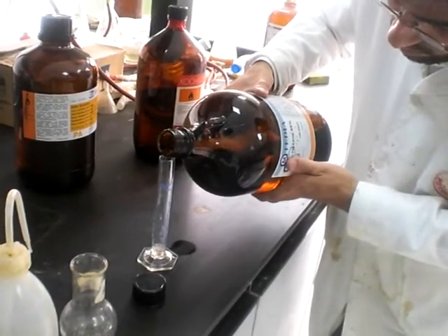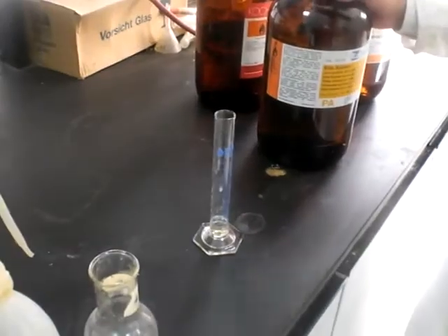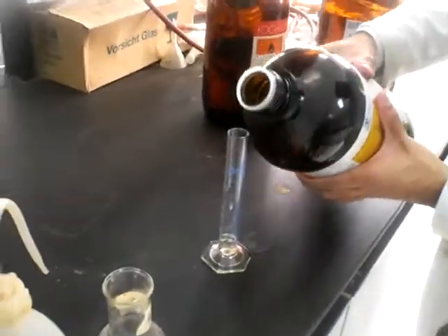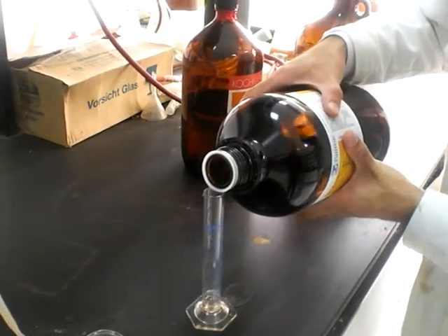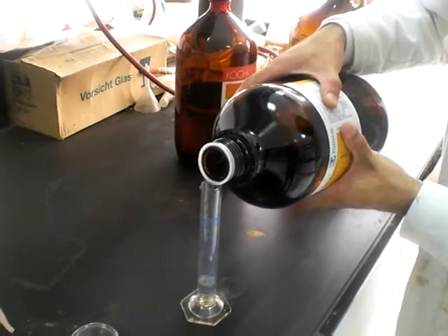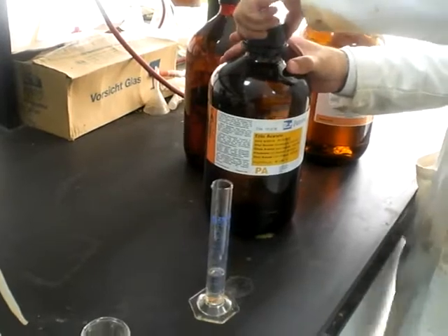The mobile phase is hexane and ethyl acetate. We add a certain volume of the hexane and another of ethyl acetate. This mobile phase is organic, non-polar, in order to suit the normal phase here, which is the silica. All the time, the stationary phase should be orthogonal to the mobile phase. If the mobile phase is organic, the stationary phase should be polar, and vice versa.